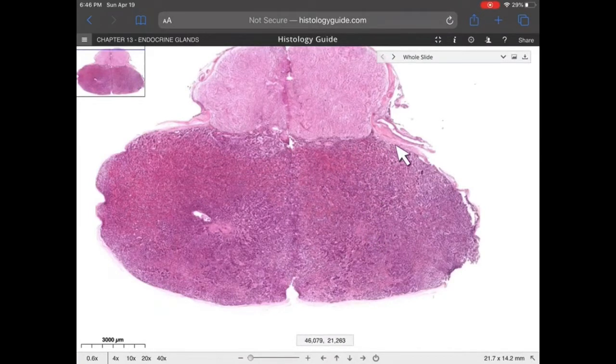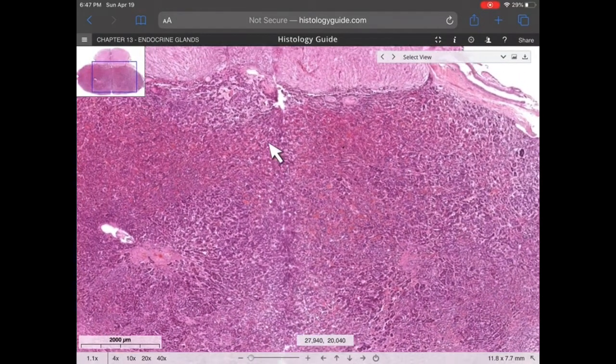the pars distalis is most of what you see here, so I'm outlining it. The reason I'm taking care to move the tip of my pointer here instead of, for example, here, is because this middle part right here that I'm dragging the cursor through, this is the pars intermedia. You can actually, if you look closely, see the boundary between the pars distalis and pars intermedia. So see where my pointer is running? There's a faint line. So down here, it's a lot more reddish, and up here, there's a lot less red, and there's also these little fluid-filled pockets or spaces. And those are called Rathke's cysts. So that's one way to distinguish the pars intermedia from the pars distalis.